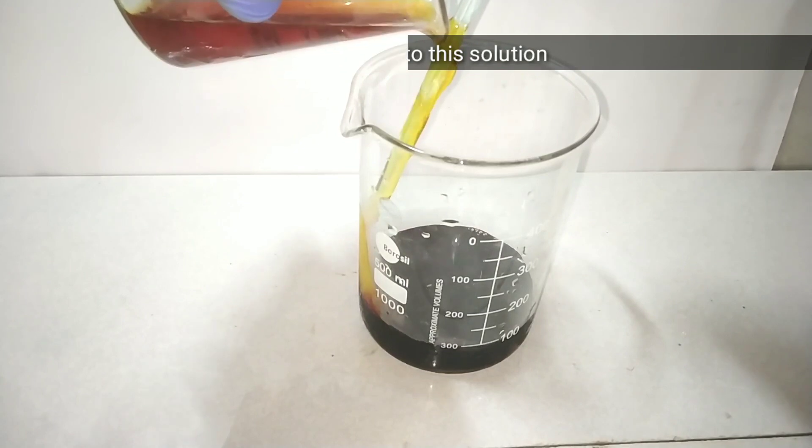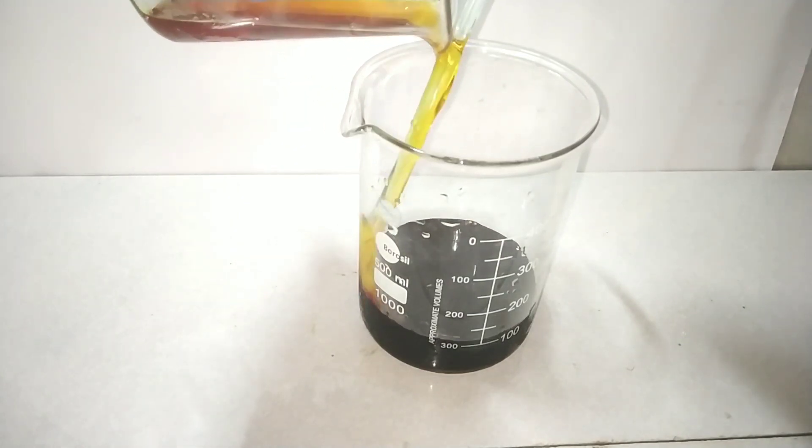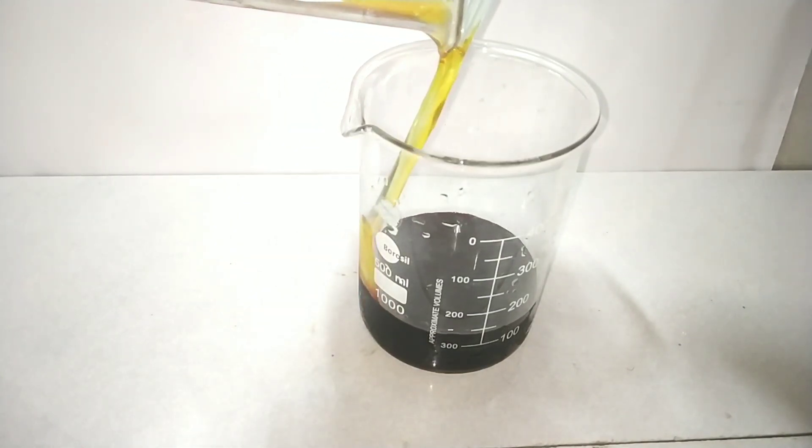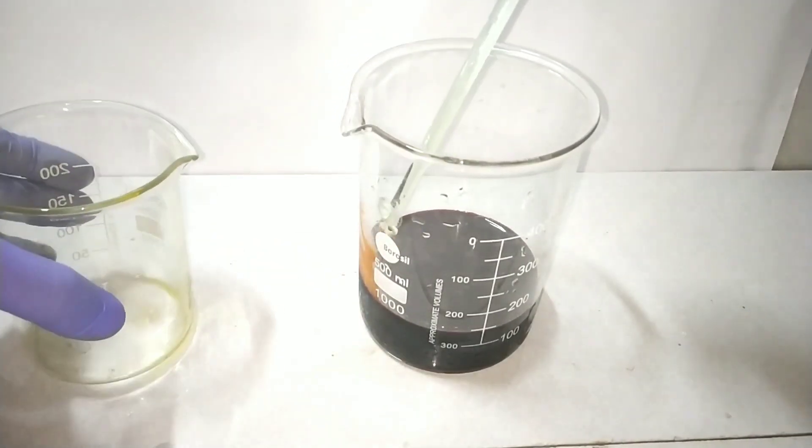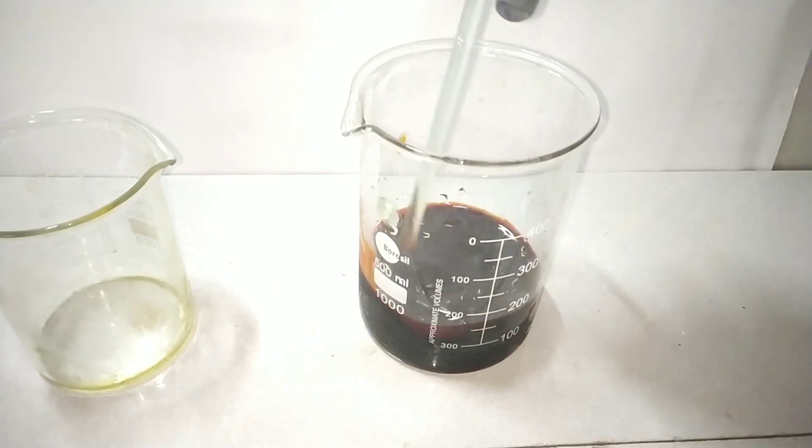When the coupling takes place, you can see a dark orange colored solution is formed. The reaction of diazonium salt with 2-naphthol is an electrophilic aromatic substitution reaction which is strongly activated by deprotonated alcohol group.